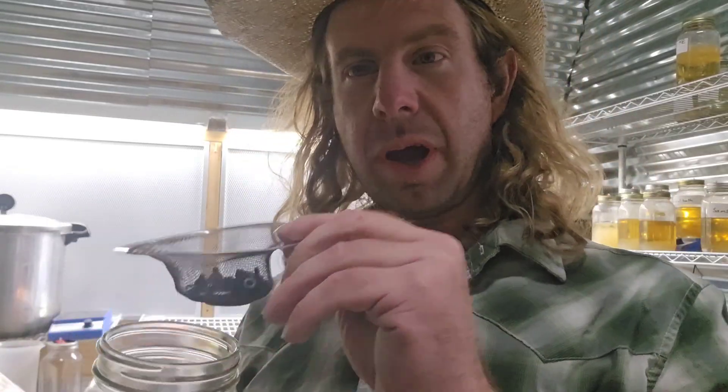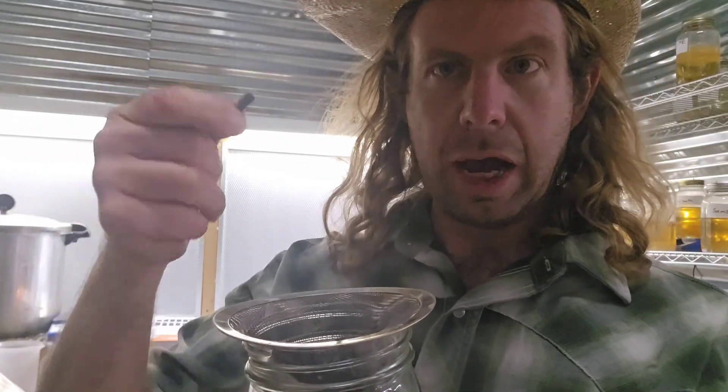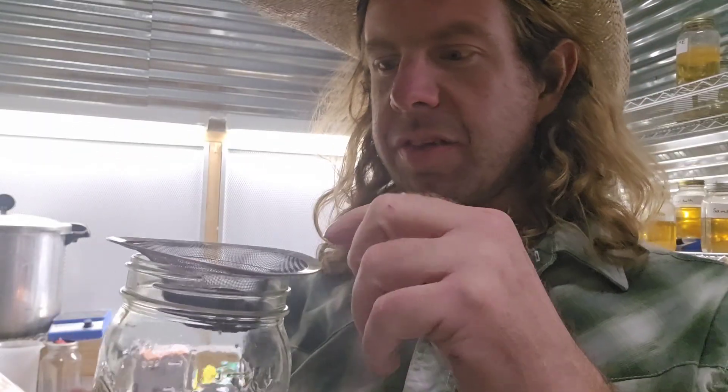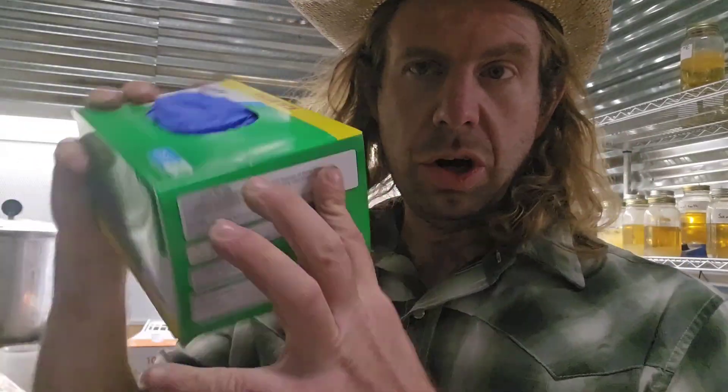Numbers twelve, thirteen, and fourteen. Number twelve: syringe caps. What I do is I sterilize these syringe caps, sterilize the sink drain, put it over the jar — the jar is sterilized — and this is how I cap my syringes, just screw the cap on. So number twelve: syringe caps; number thirteen: the sink drain apparatus; number fourteen: more jars. You will go through so many jars on a mushroom farm — I have hundreds of jars — so you can never have enough jars.